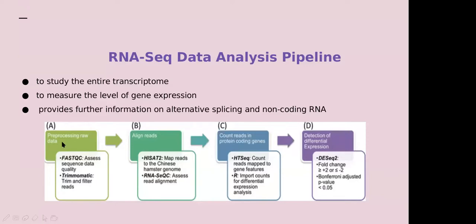So doing the QC, quality control, and aligning are the same for all sequencing, but I'm just focusing on RNA-seq here. Only RNA-seq is different from the others.